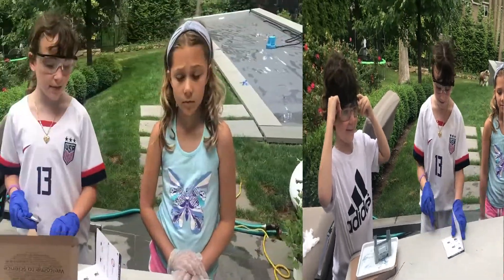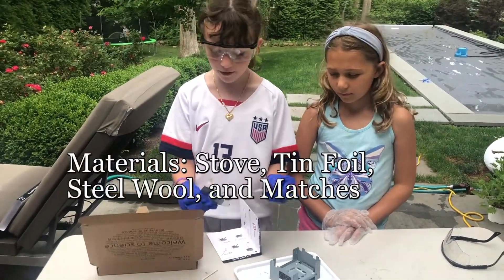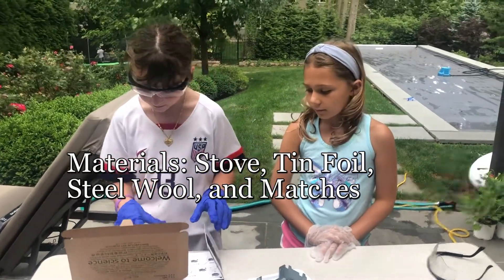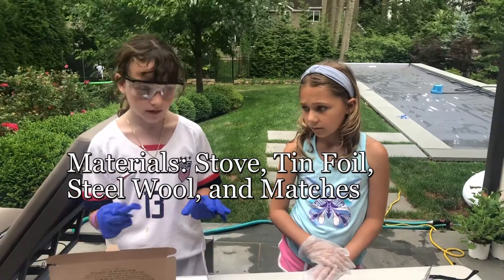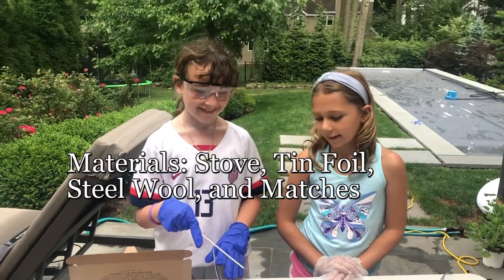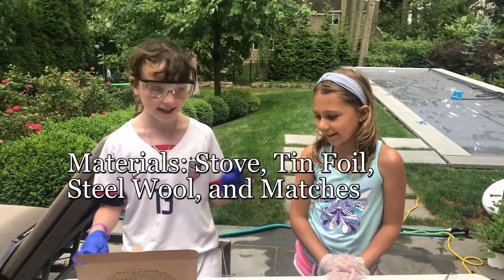For this experiment we will need a Bunsen burner, tin foil, steel wool, like a stick to hold it, and a lighter.